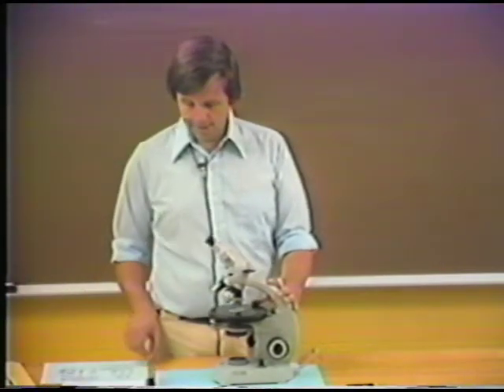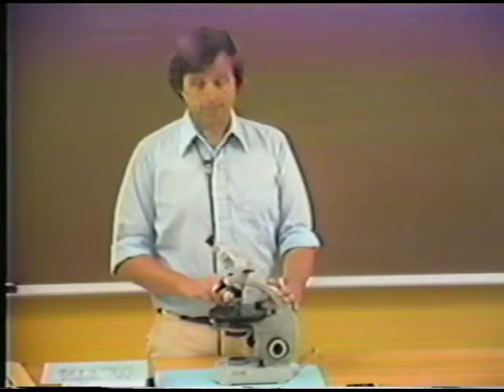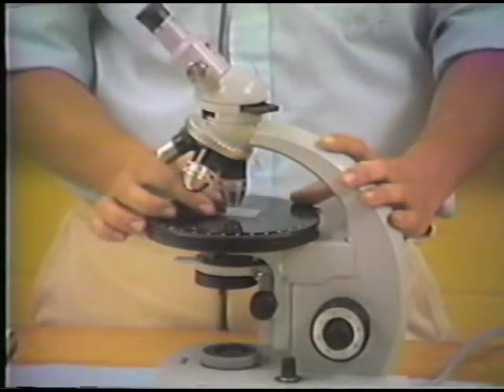Well, let's now look at the kind of interference figure that we obtain if we cut the vertical section of the indicatrix. So I'm going to go back now to our quartz mount. And this time we're going to look at a mineral grain in which the C-axis of the quartz is actually lying on the stage of the microscope. And the kind of interference figure that we see in this sort of orientation is very different.